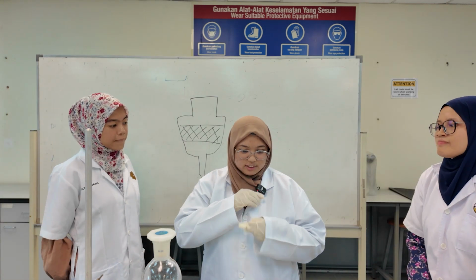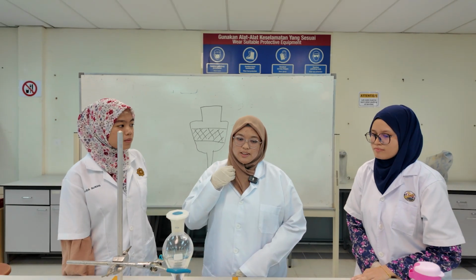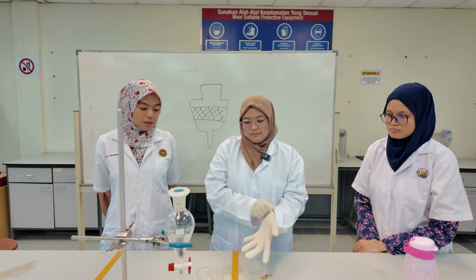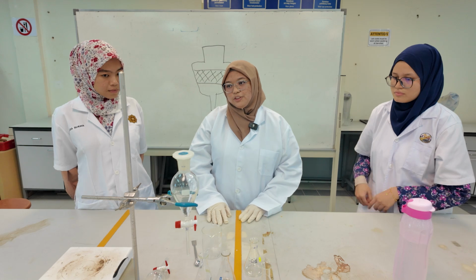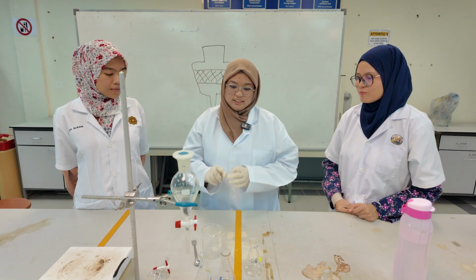Alright, thank you. I will be explaining the procedure as well as the health and safety precautions. The first one is the most obvious one. Make sure to wear a lab coat and gloves to avoid any skin contact, because for this procedure we will be dealing with 3 compounds and reagents, which are acid, base and neutral.